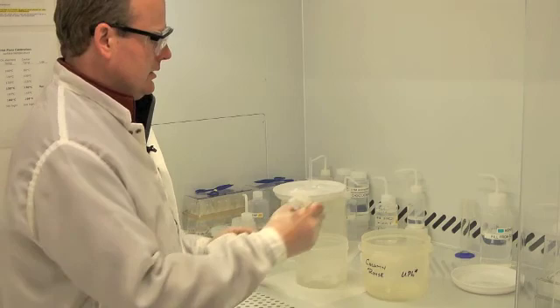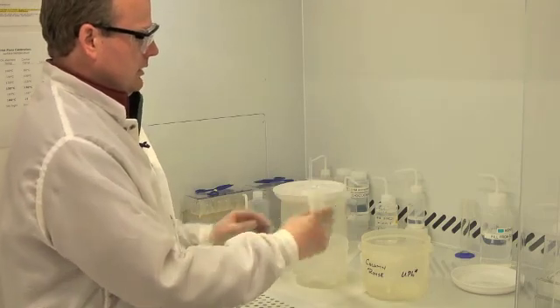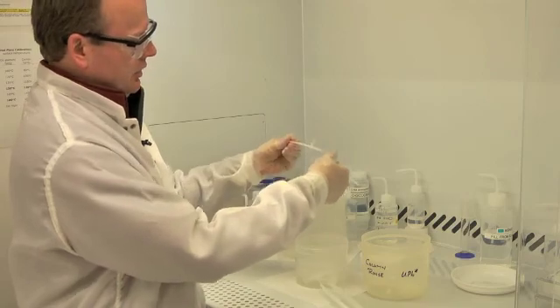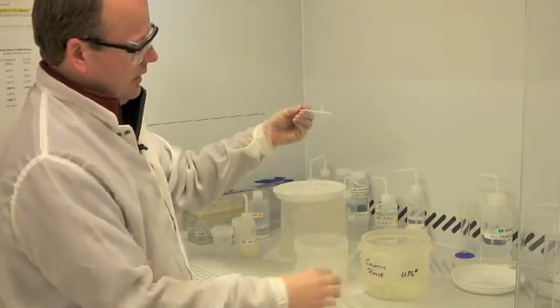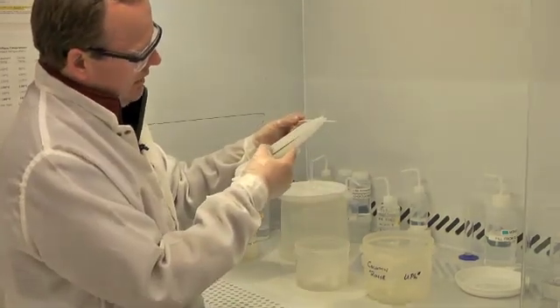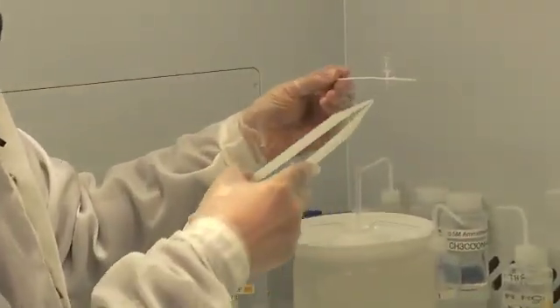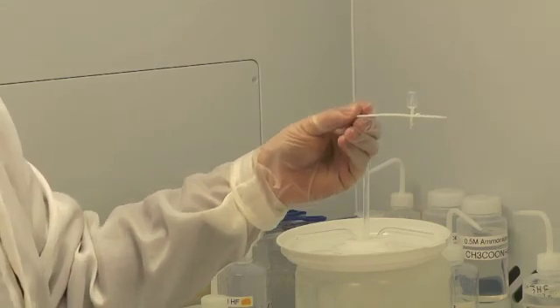That separation takes place in what we call a column. This is an example of an ion exchange column. It's a miniaturized version which has a thin, narrow column, a reservoir at the top, and at the bottom is a porous plastic frit.